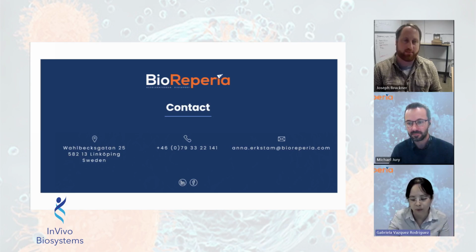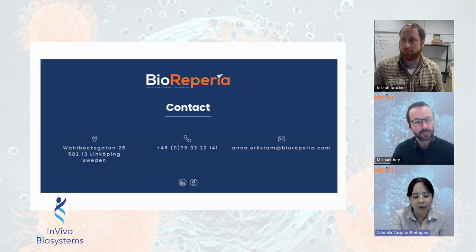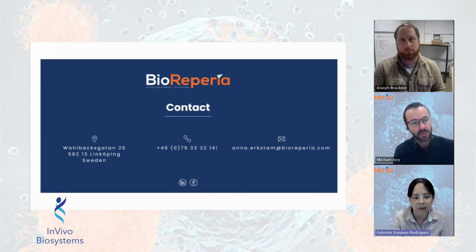I think more towards immune oncology, probably. So the lack of an adaptive immune system is not a problem, well, for the experiments, from our perspective, because as I showed, we can inject the human immune cells, lymphocytes, NK cells, PBMCs. So it's possible to have that human environment in the zebrafish larvae, and evaluate how the immune response affects the dissemination of cancer cells, and also all their interactions in the tumor microenvironment.